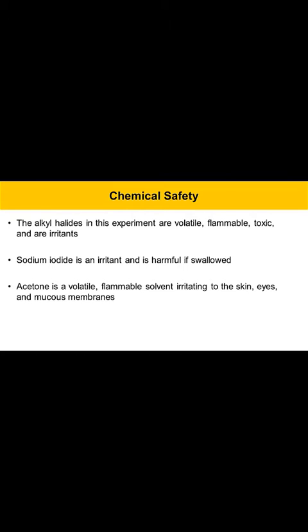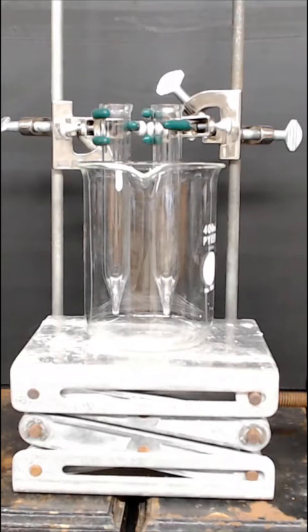All of these reagents should be handled with care, wear gloves to avoid chemical exposure on your skin, and work in a well-ventilated space. Set up the apparatus like this with two point-bottom test tubes and a beaker.